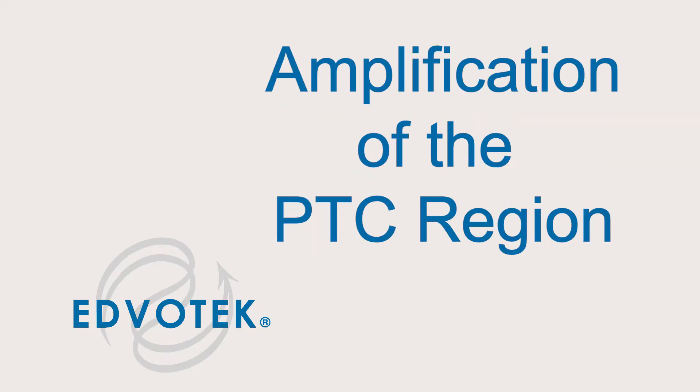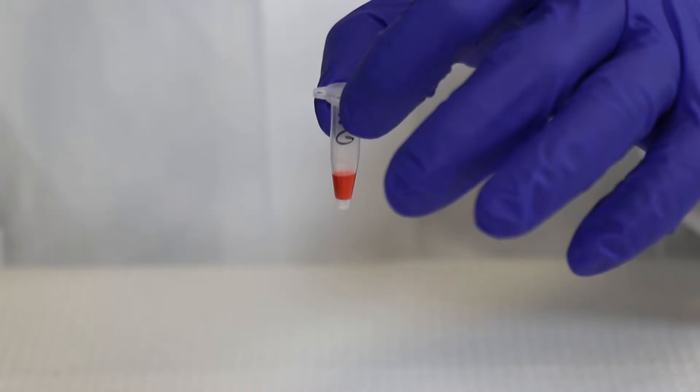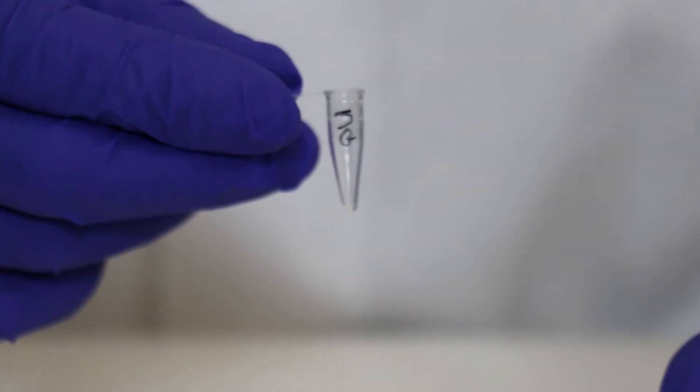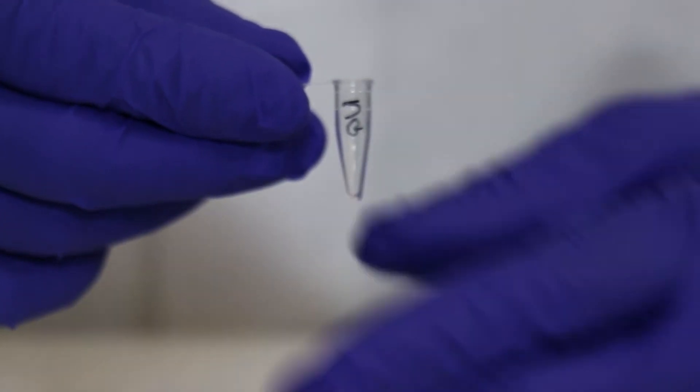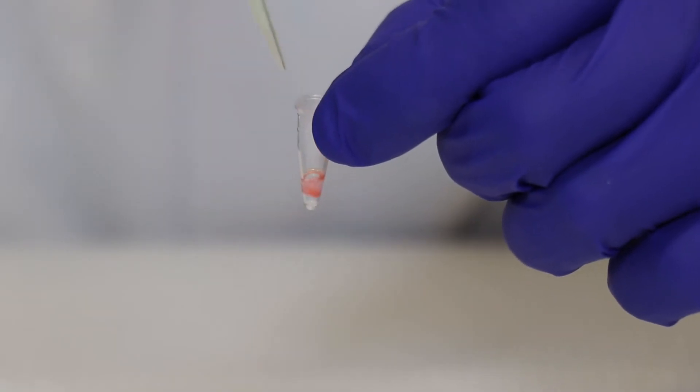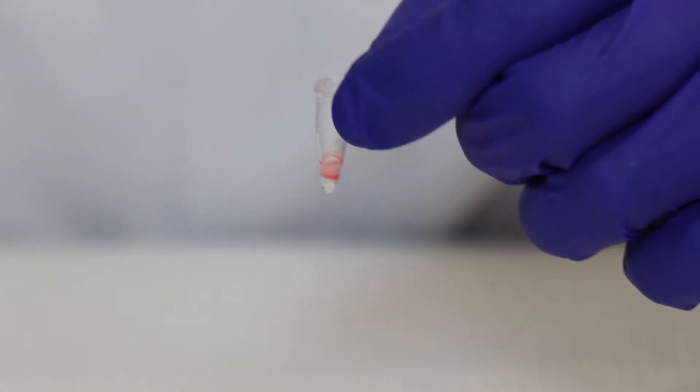Module 2: Amplification of the PTC Region. Step 1: Obtain the extracted DNA from Module 1. Step 2: Label a fresh 0.2 milliliter PCR tube with your initials.